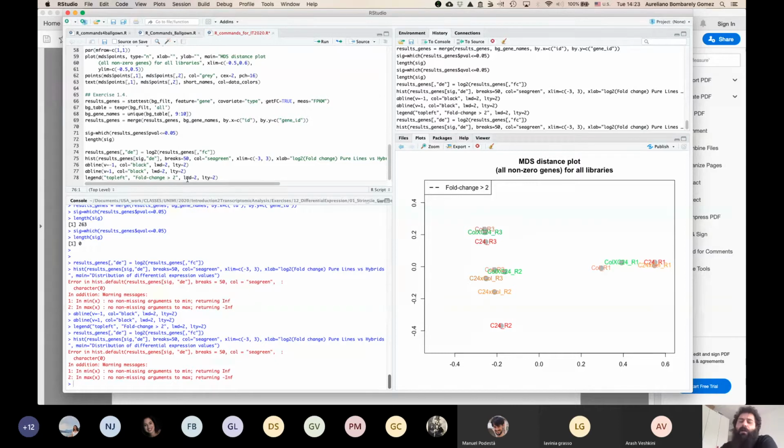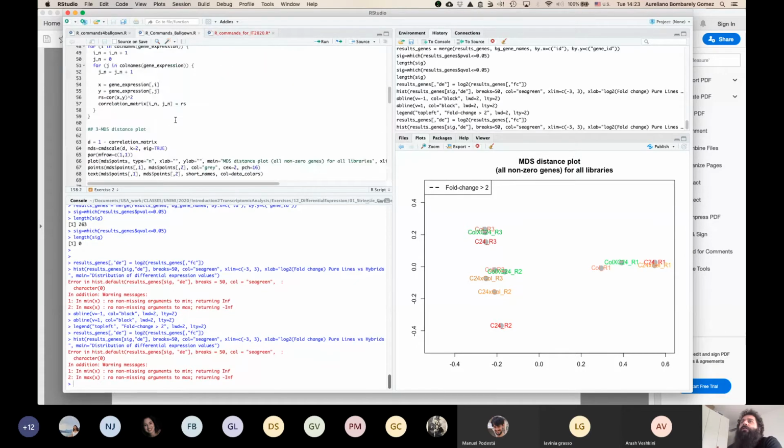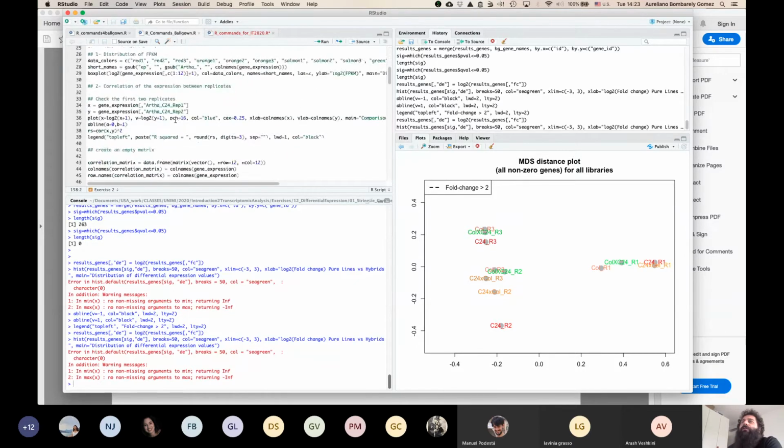The thing is, when you copy and paste commands, you always have these kinds of problems, when you pass from one font to another. So let me see, I should have the real command here.